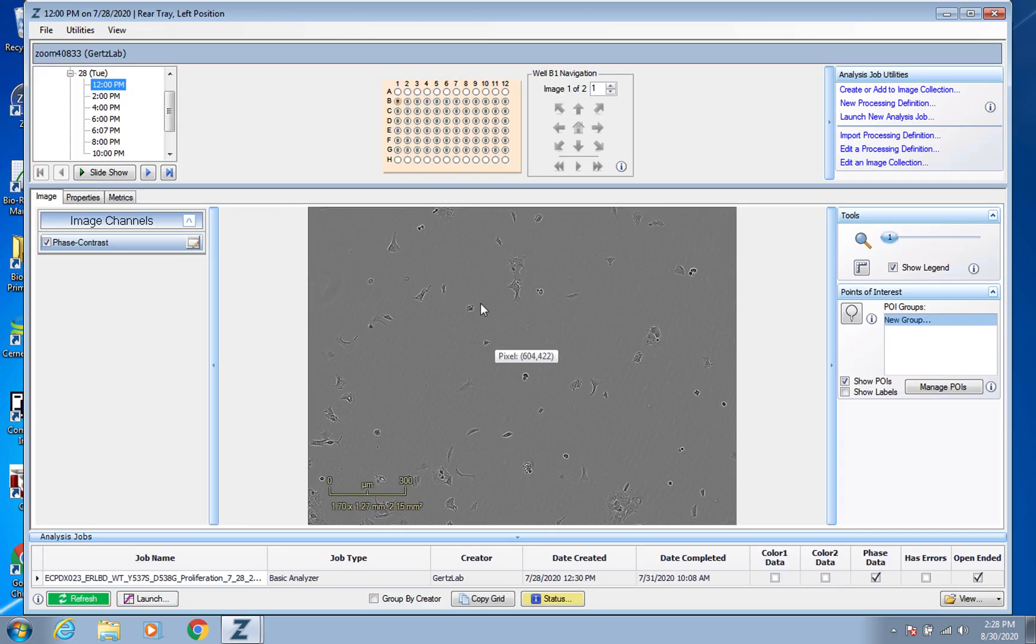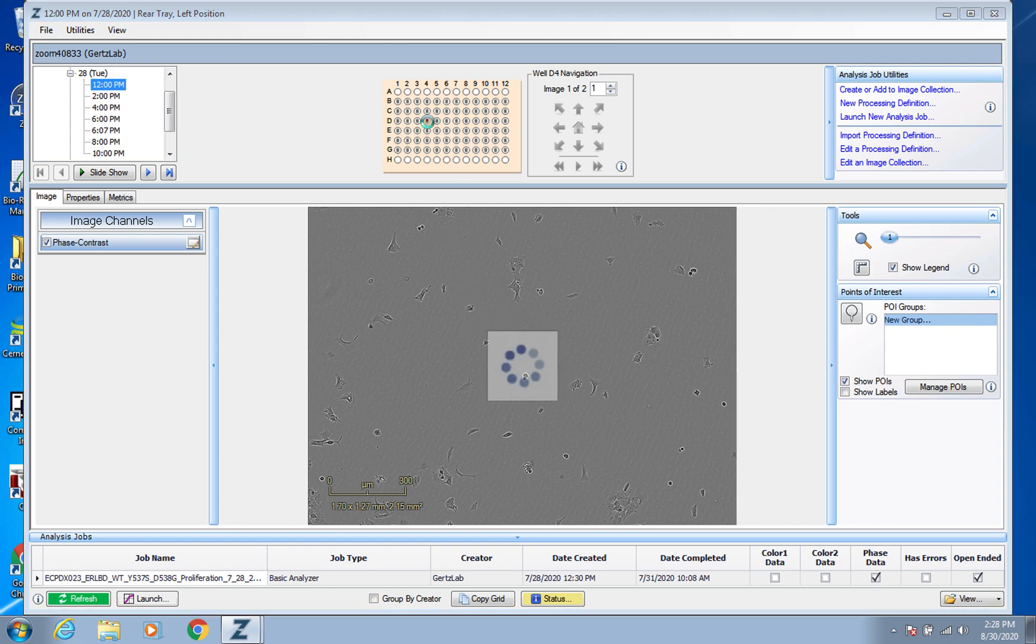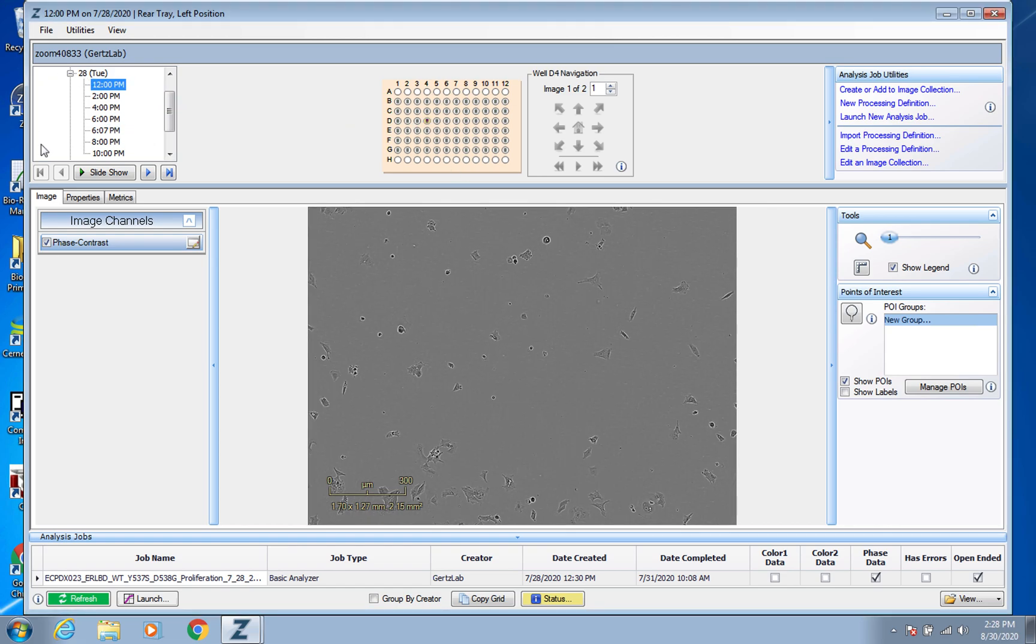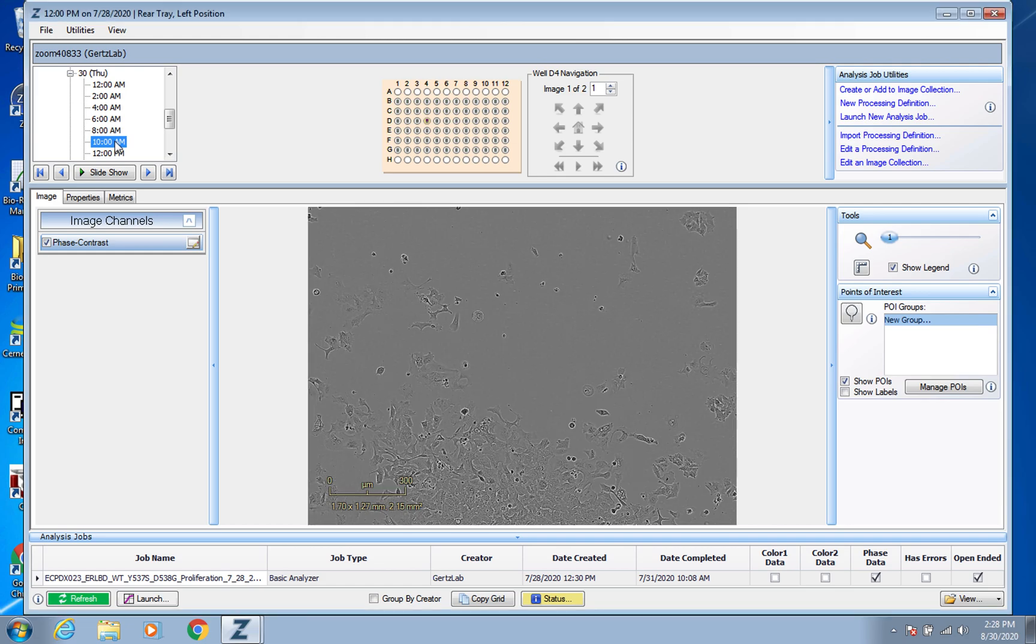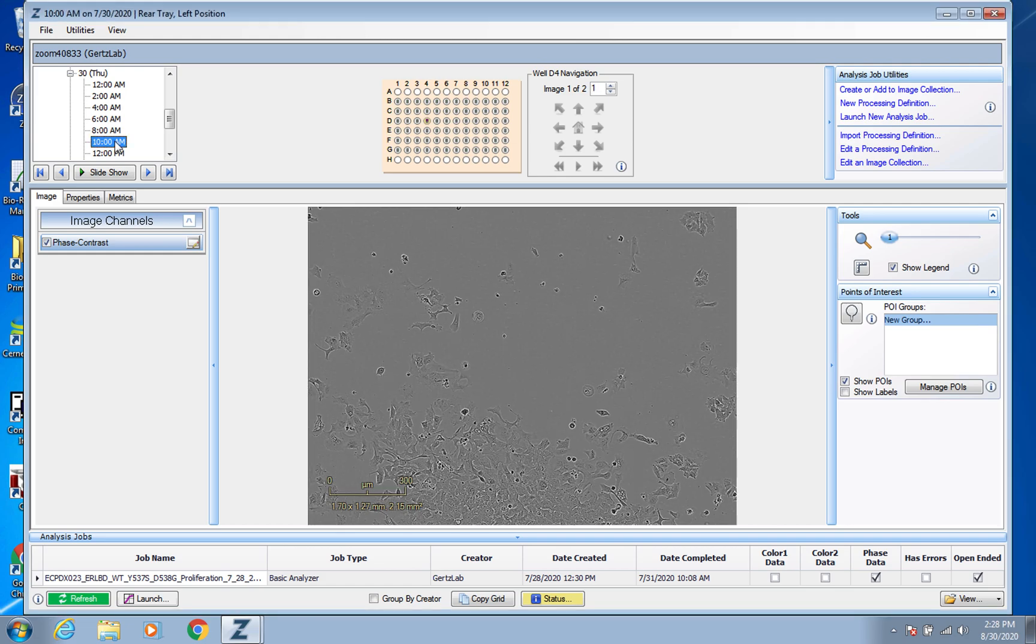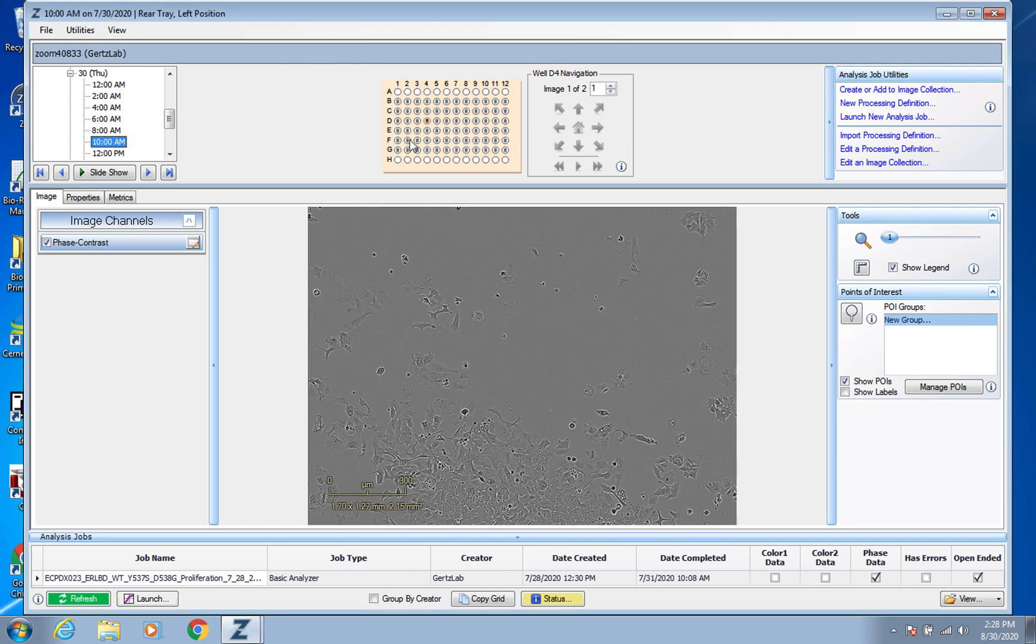So now you're just on a screen where you can look at different wells, you can look over here at the top left at different time points and click for a later time point and see did those cells grow or not grow, whatever you might be expecting depending on what treatment they're undergoing.